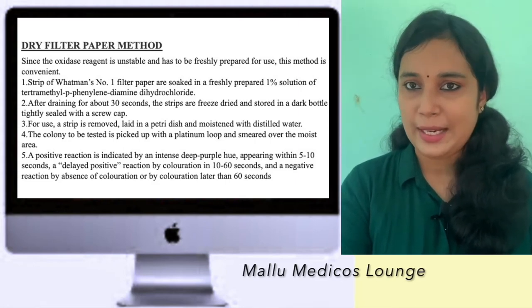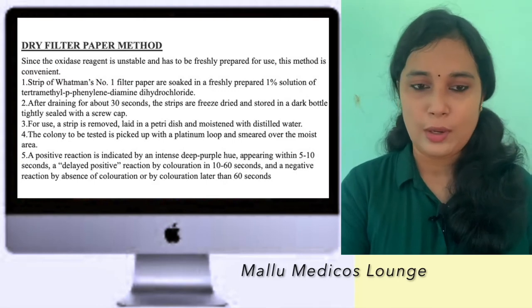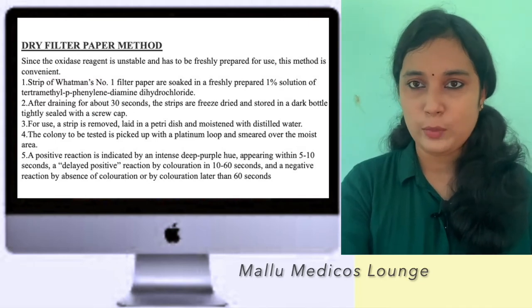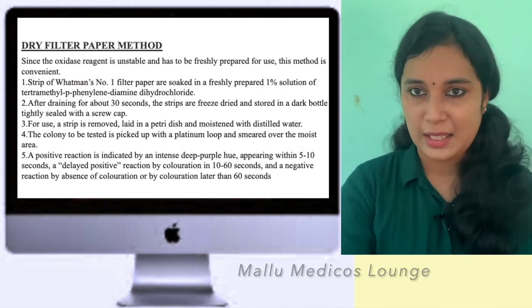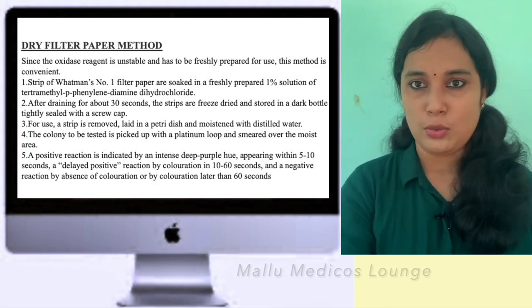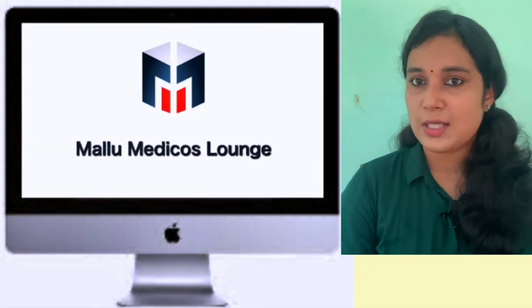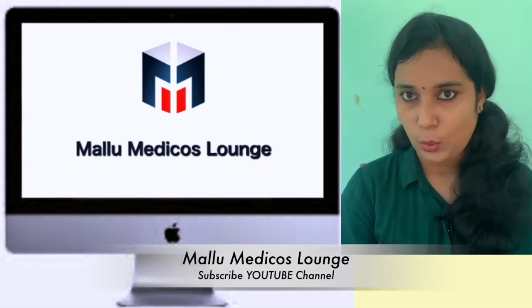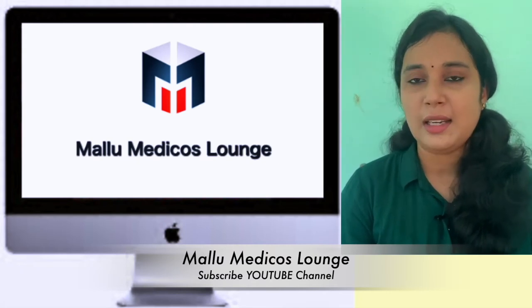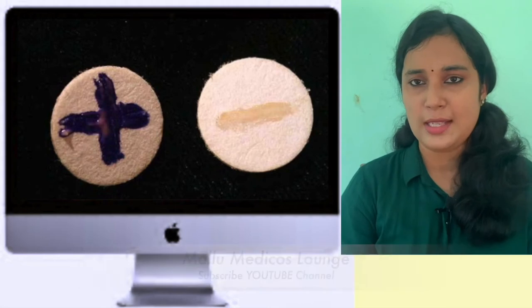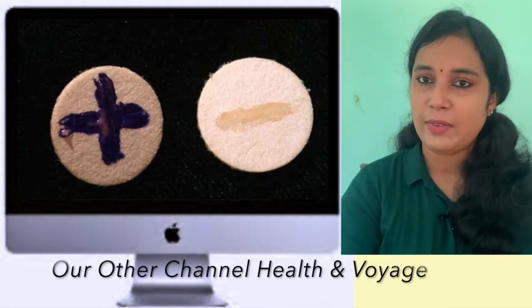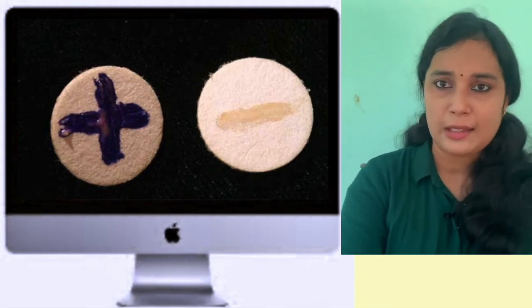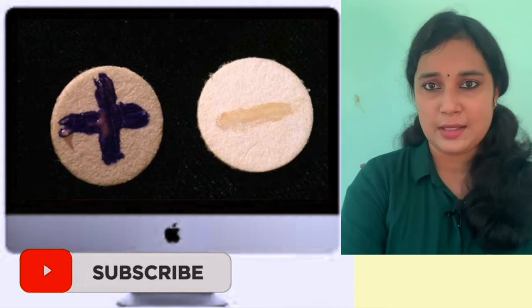We immediately observe for color change. A positive result shows an intense deep purple-blue color within 5 to 10 seconds. A delayed positive result appears between 10 to 60 seconds. After 60 seconds, the result is considered negative.